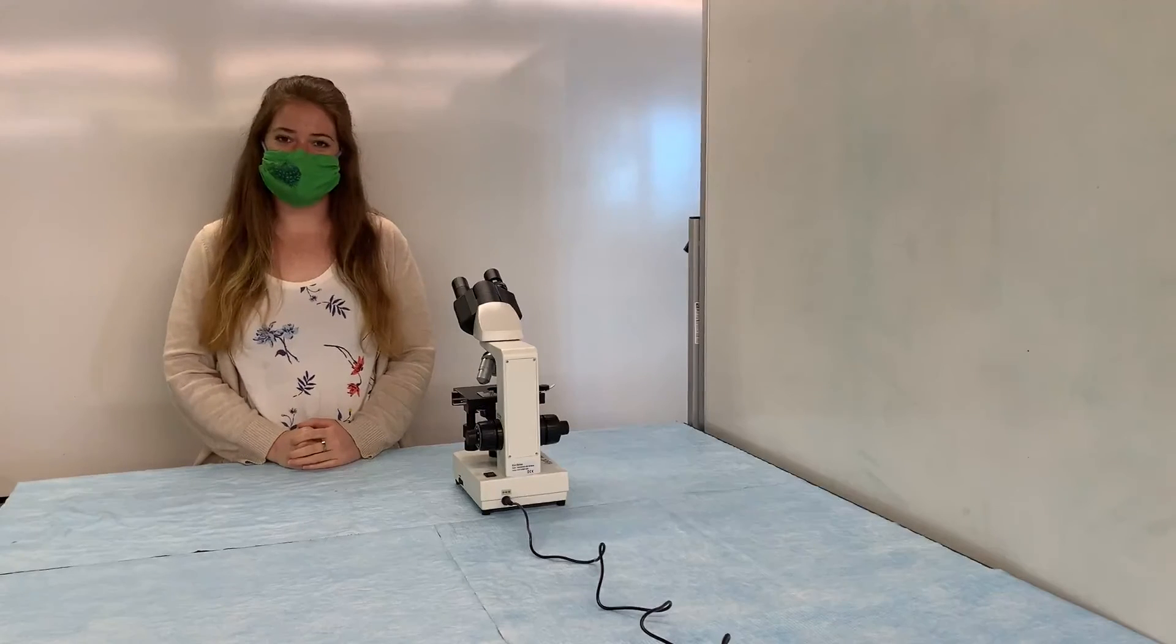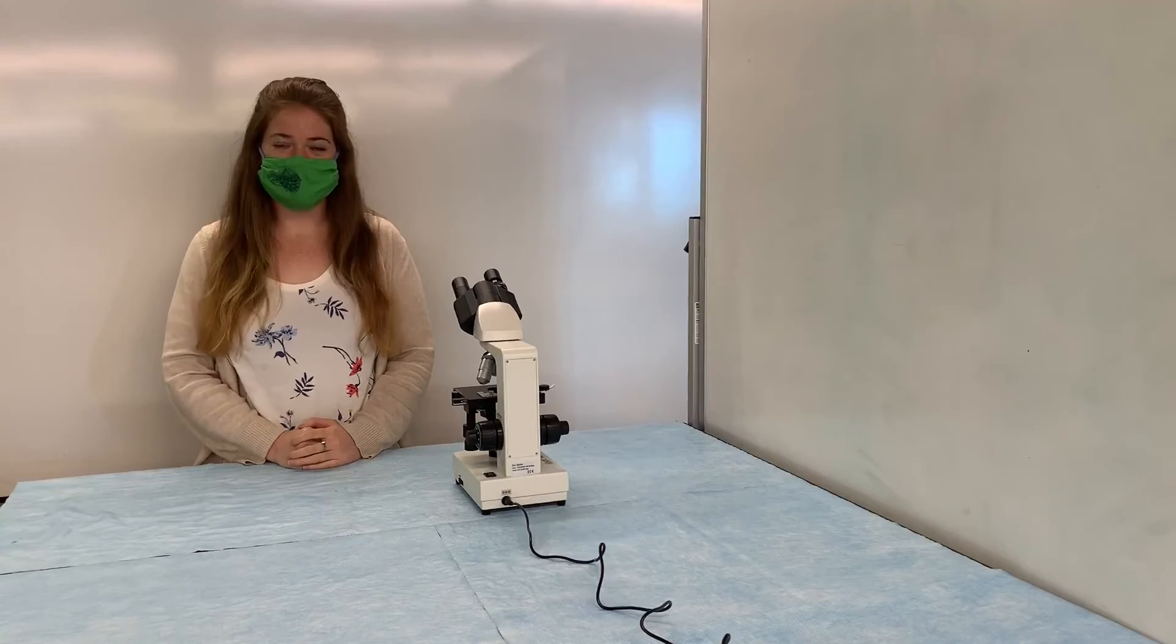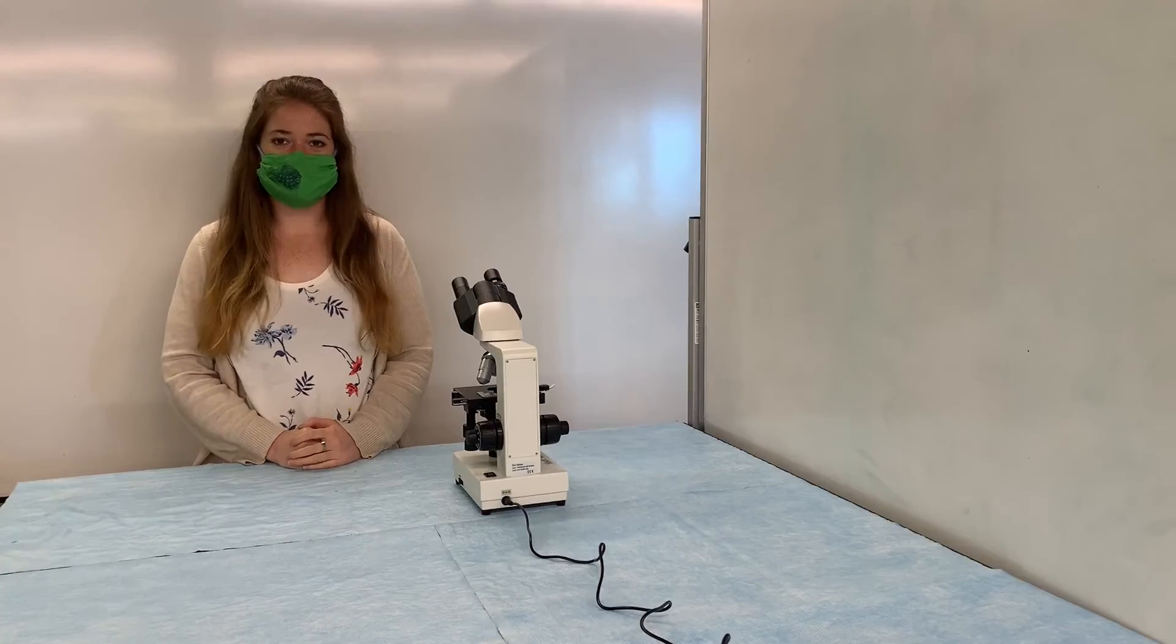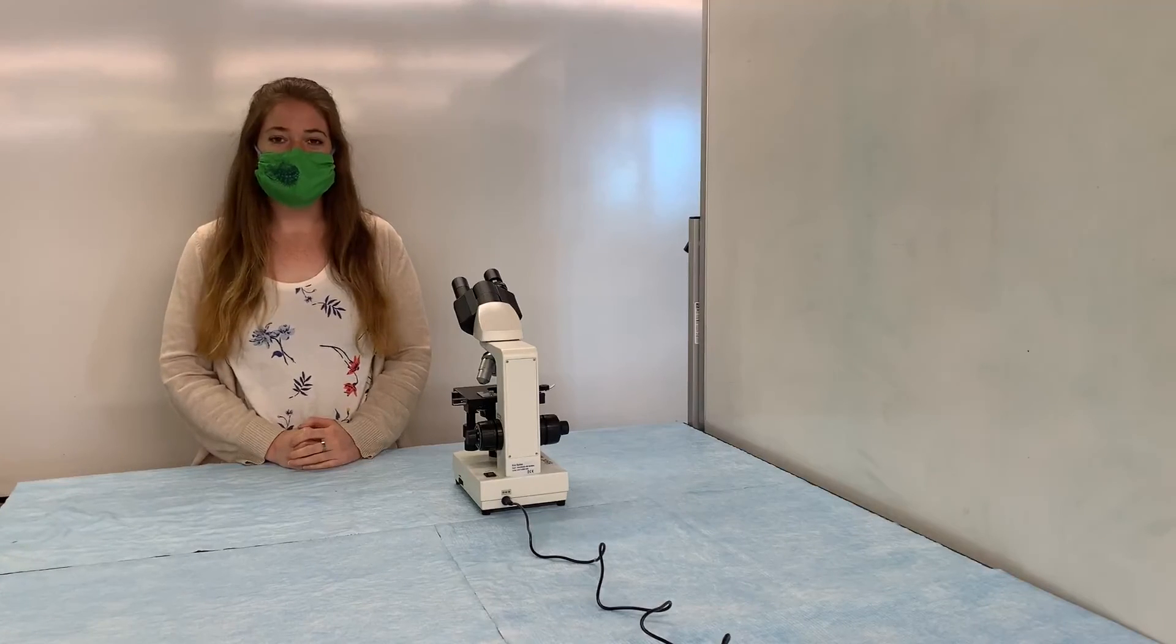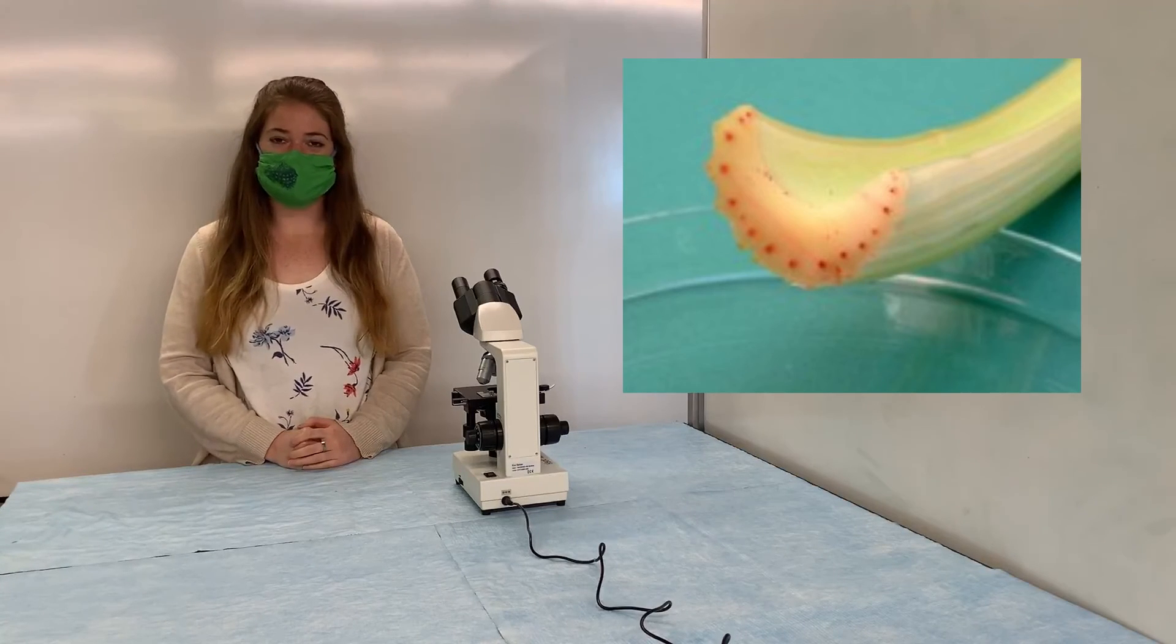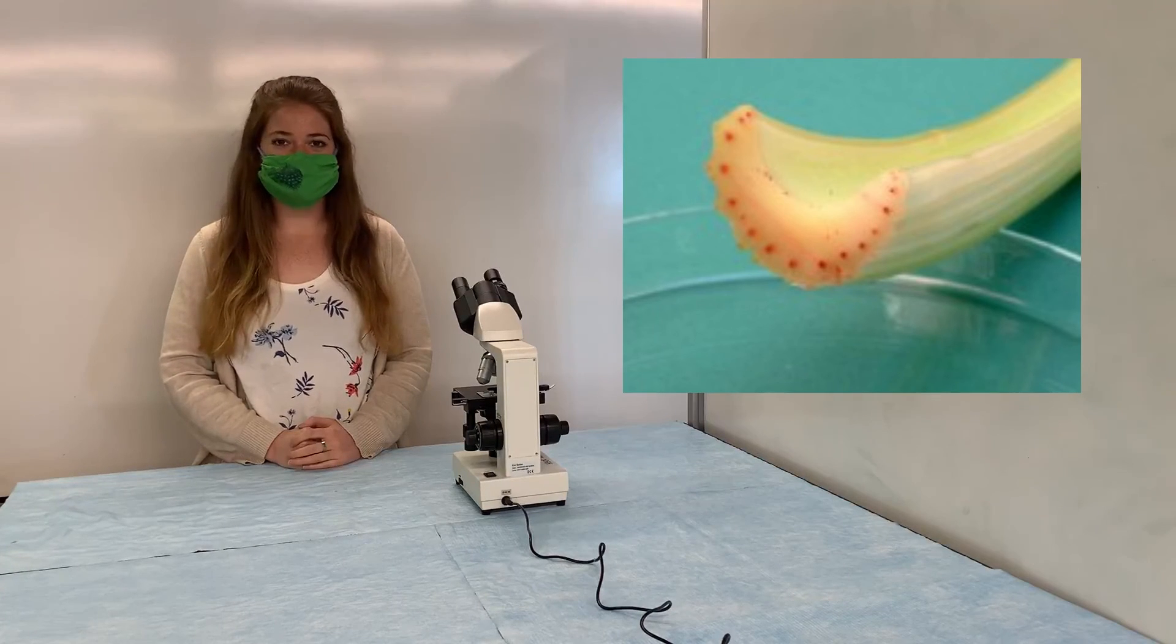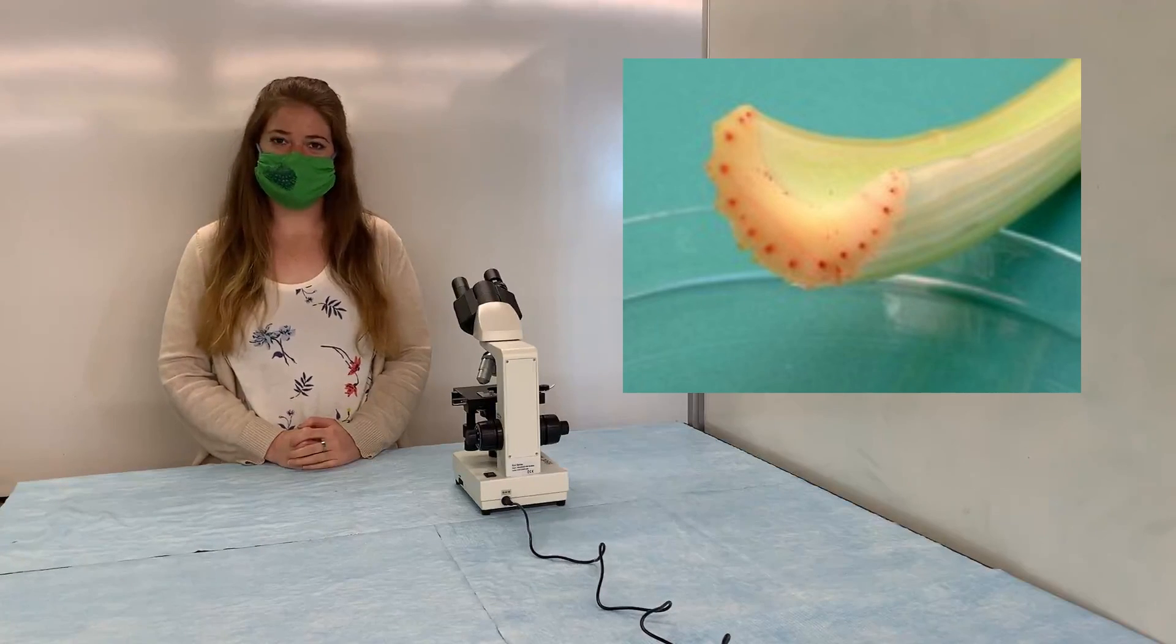Now that we've looked at some cross sections of stems under the microscope, I'm going to show you some celery that has been dyed so we can view its vascular bundles. Based on what you saw under the scope and what you've learned at this station, you're going to decide whether the celery is a monocot or a dicot and record that on your handout.